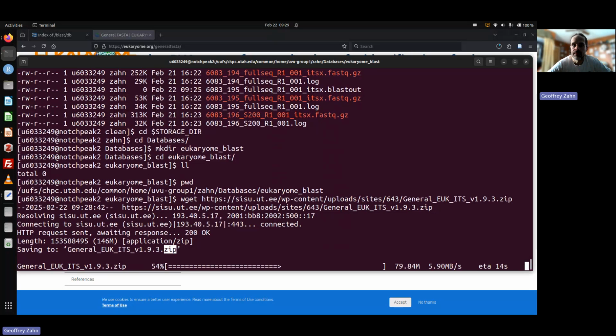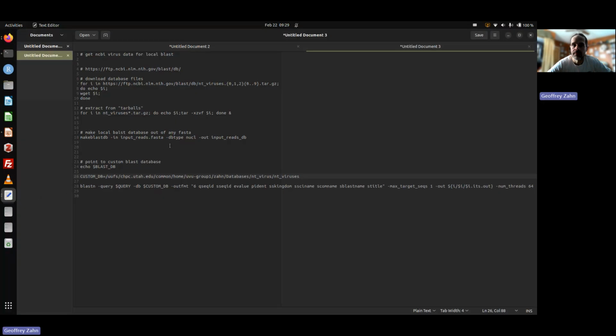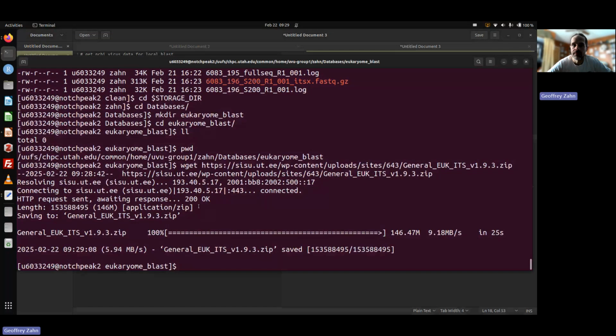And then what we're going to do is make a BLAST database. So like all those .nts and .nob files, that's a BLAST database. They were made from a FASTA. And so we can actually make a BLAST database. You give it some input. You tell it whether it's nucleotide or protein, and you give it the base name of an output. And that's it.